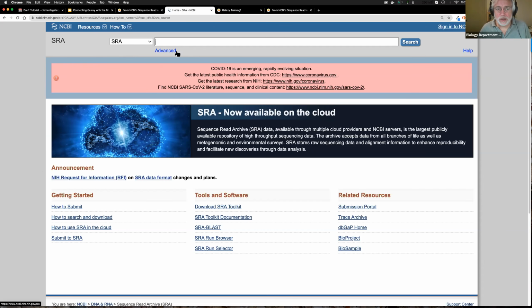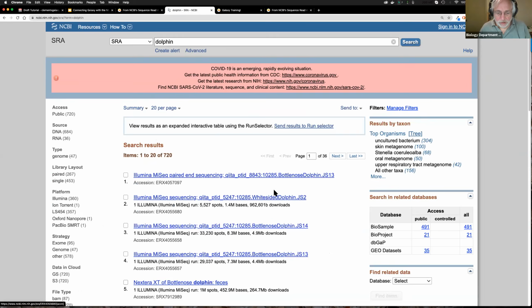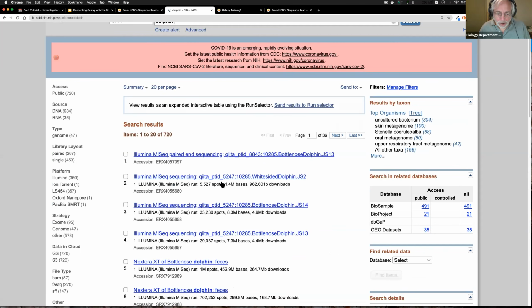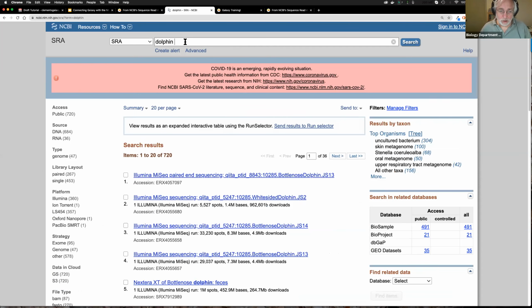you've used NCBI or SRA before. And you can type anything here. And so I'm going to borrow something from Yuri because Yuri likes dolphins. And so we're going to search for dolphin. Okay. And it comes back and it gives us 720 results. And we go down and there's a lot of them, and that's cool.